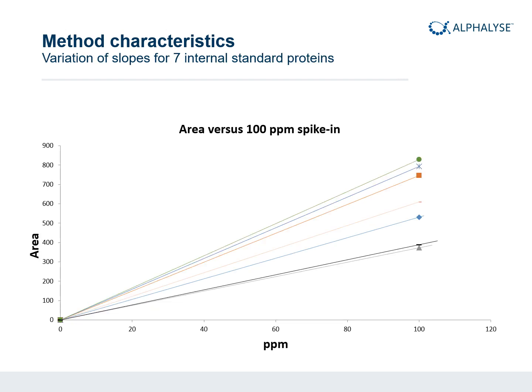Then most people who know about mass spectrometry and proteins will argue that different proteins generate different peptides, and different peptides will behave differently in a mass spec instrument. And that's completely right. Some peptides will fly better than others and generate a higher signal, even at the same concentration.